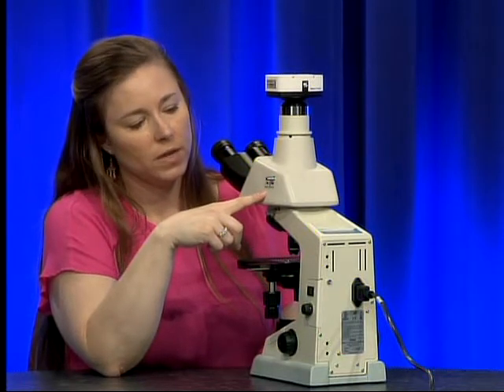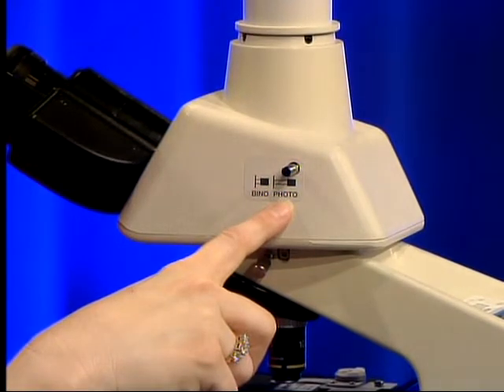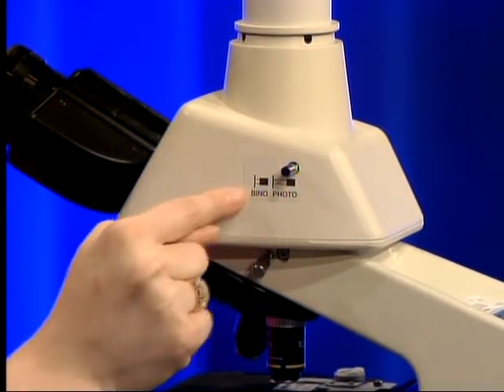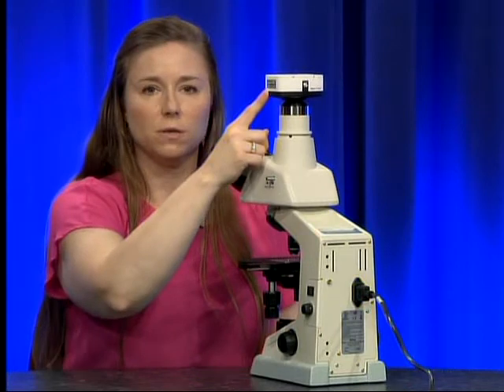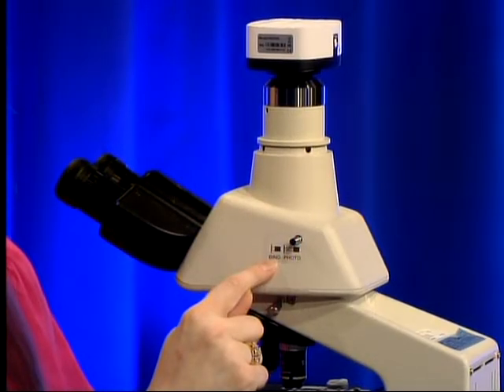On the side of the microscope you will see a sticker that says 'bino/photo.' This slide switch adjusts whether the mirror on the inside is directing the light to the camera or to the eyepieces. For daily operation of the microscope you are going to want to have it set to 'bino' for binocular.